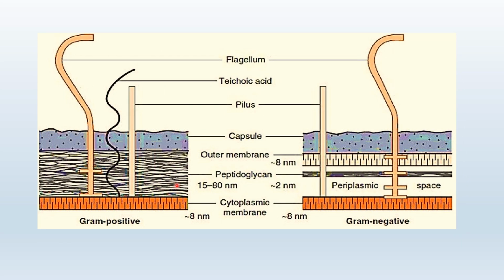This is again the repetition: gram positive with a thick peptidoglycan layer with no outer membrane, and gram negative with a thin peptidoglycan layer and an outer membrane that contains lipid.